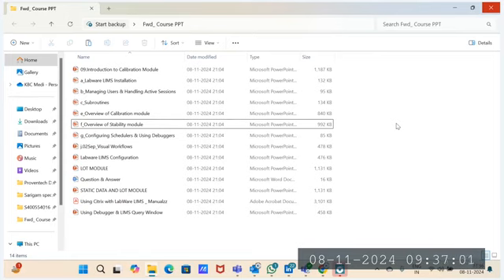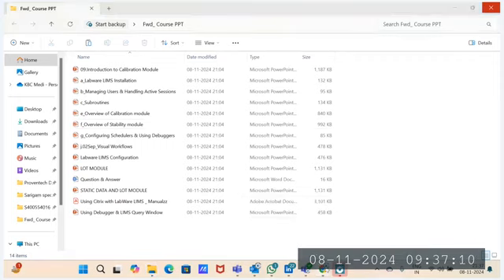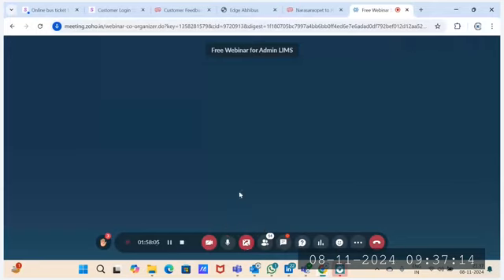Then we go for discussion of these types of activities, and then you will get complete information. So this is what I want to communicate, which is related to Labware LIMS tasks.